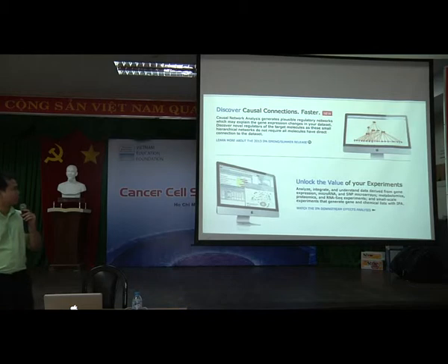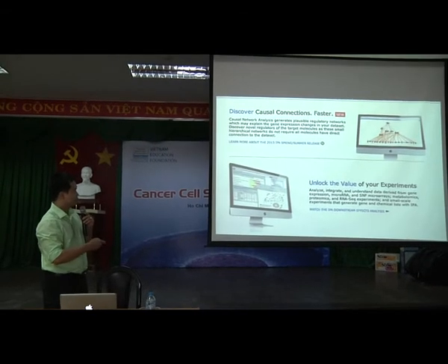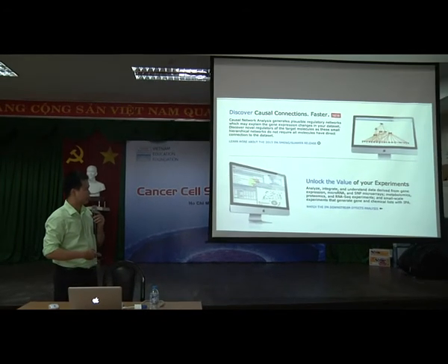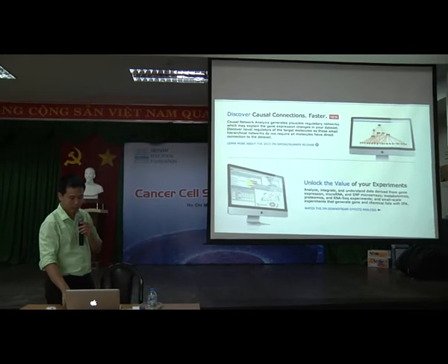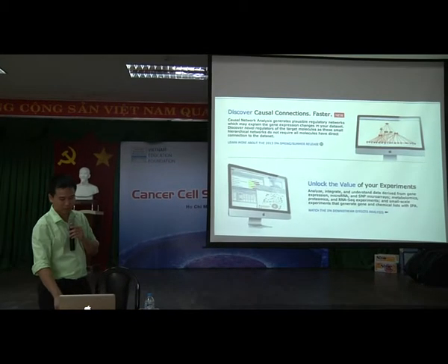And IPA can also help us to determine the causes of tumorigenesis or any kind of disease. And this is the image I took from the website. This is a little advertisement, but I want to show you how powerful IPA is. Basically, they say it can unlock the value of your search, what I say.